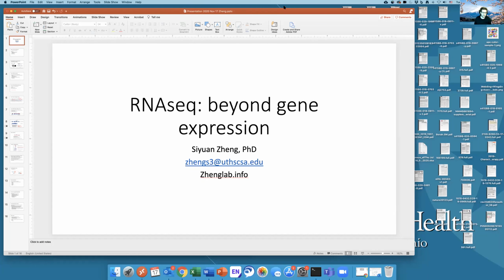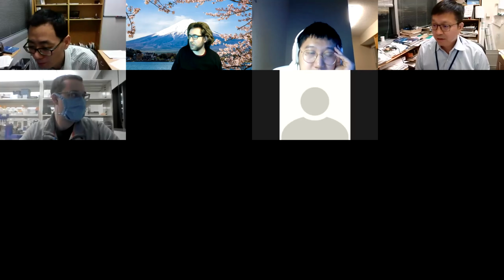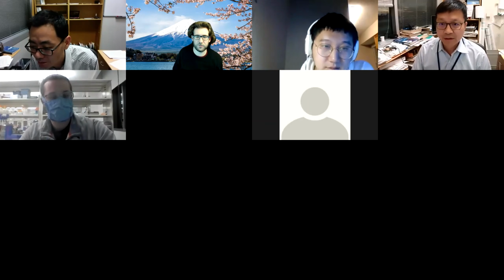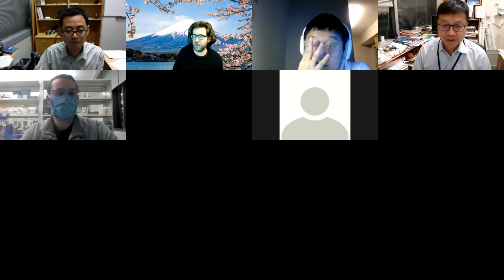Sure. Well, this is great. Because we covered a lot, I wanted to see if any of the students have any questions or had any issues getting IGV to work with those BAM files. Okay. Does anybody have any questions about why you would use IGV, or what the purpose of visualizing it at this genomic level would be?